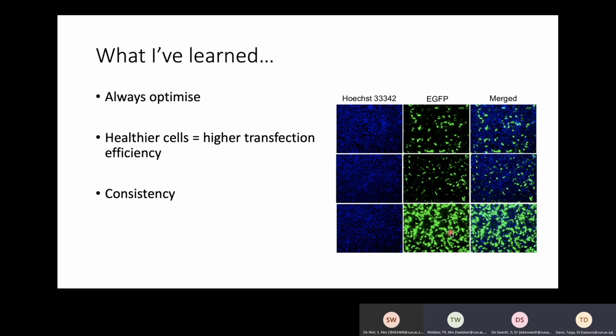All right. One thing we wanted to do is try to knock down a gene in patient cells, in PBMCs. How does that differ from cultured cells? Would I need to consider different things? Technically you don't need to consider anything else. But I do know that primary cells are notoriously difficult to transfect.